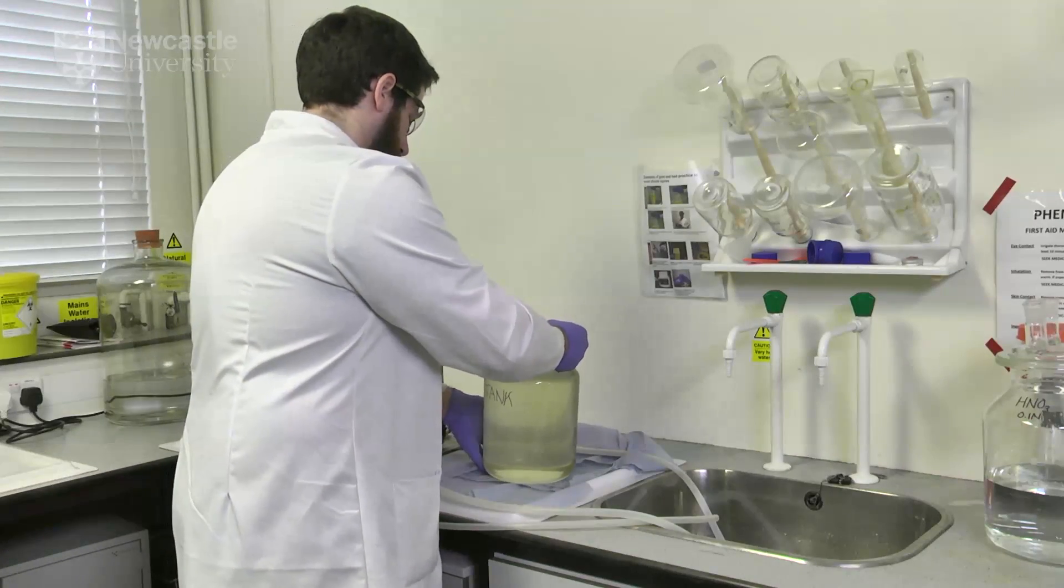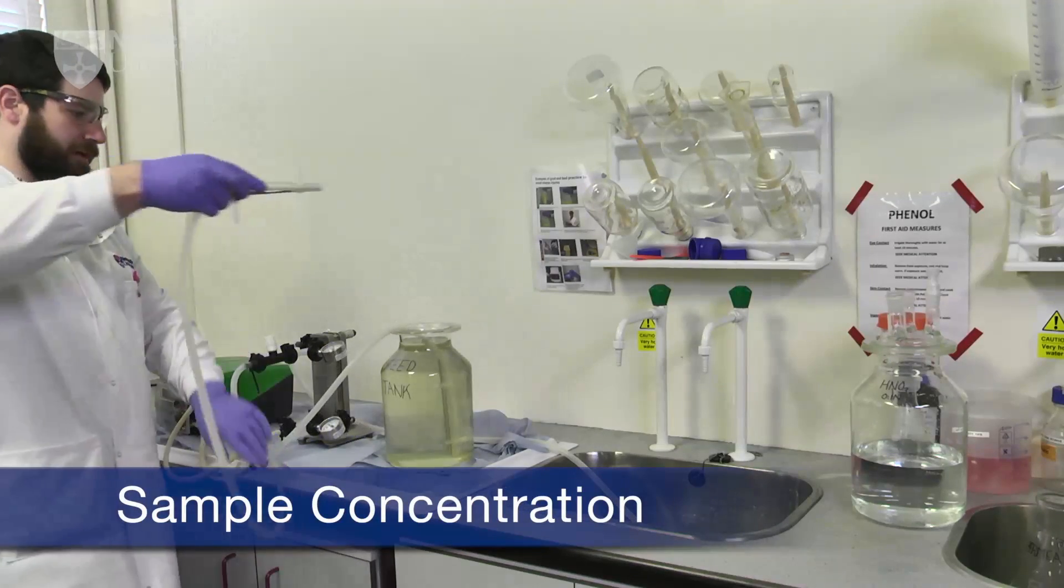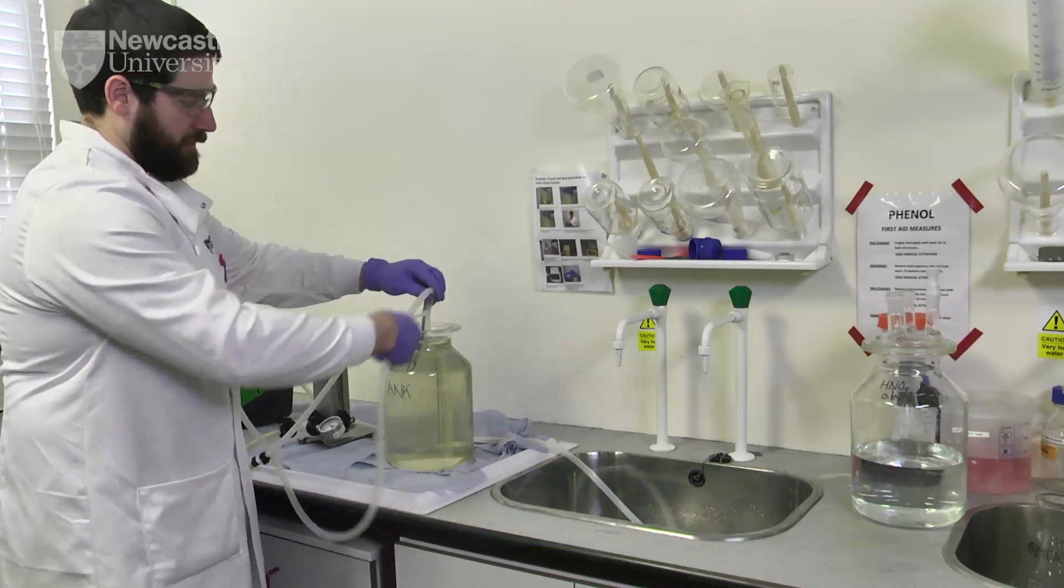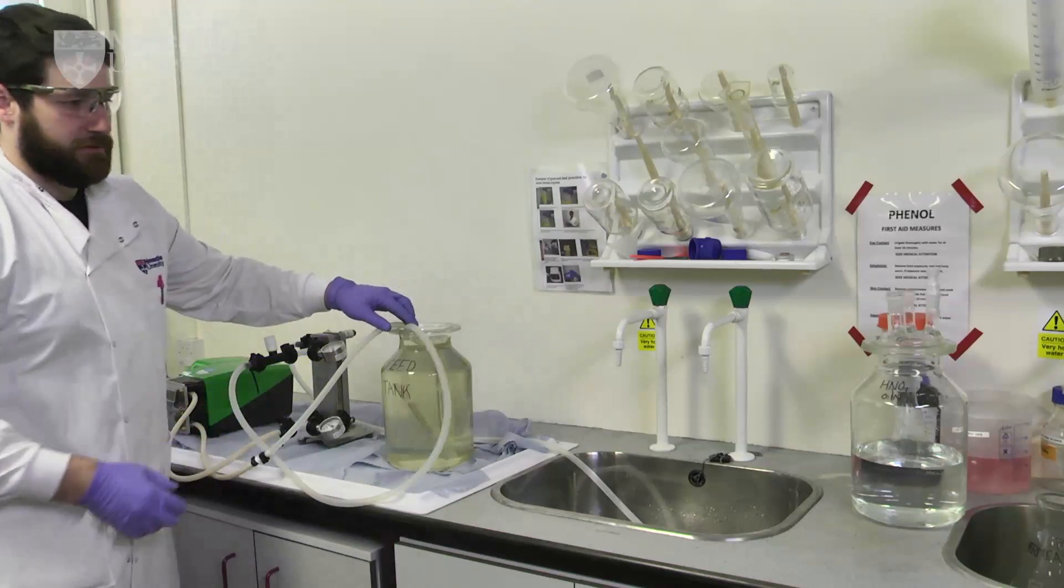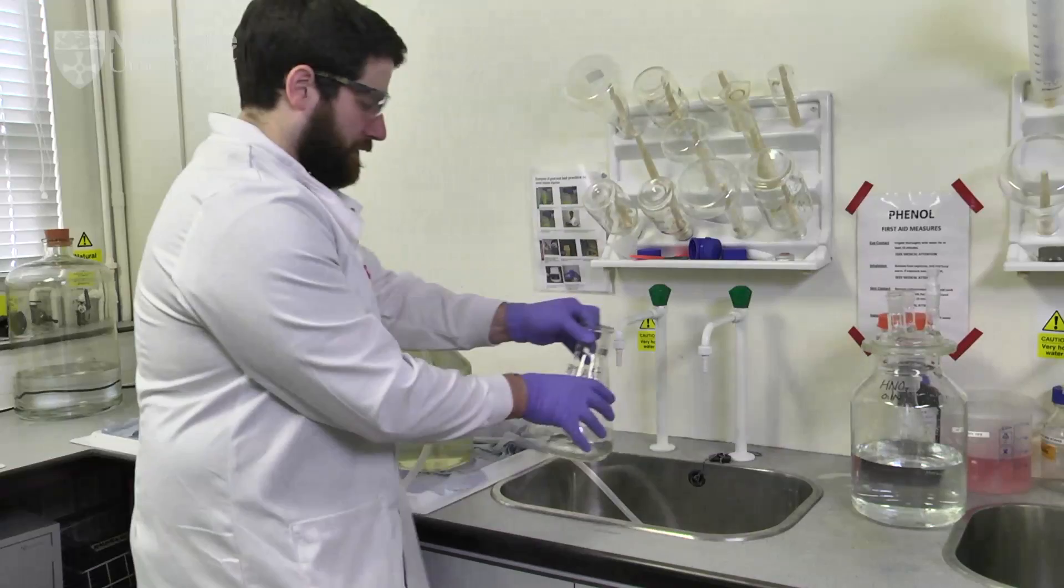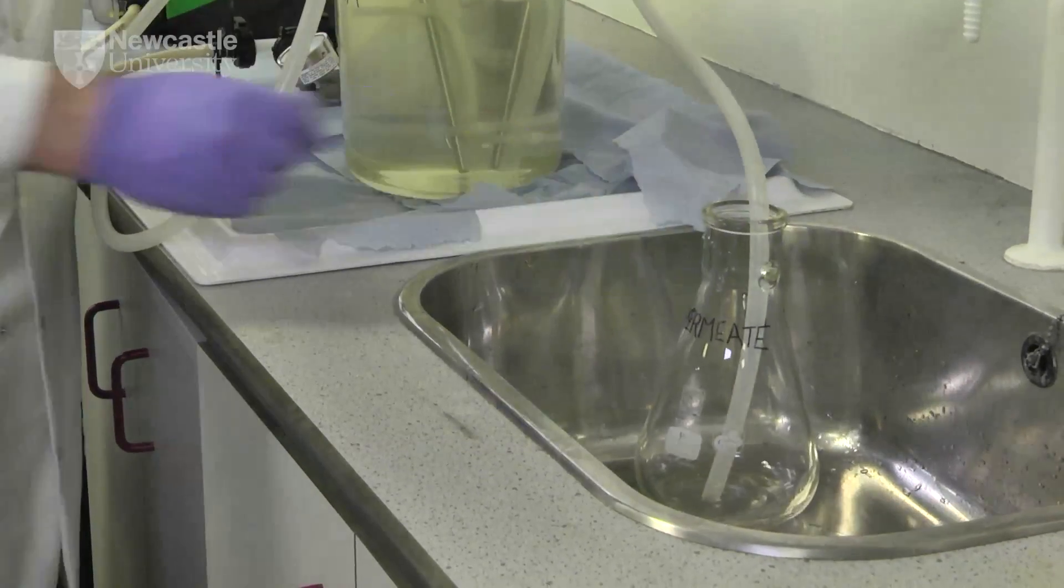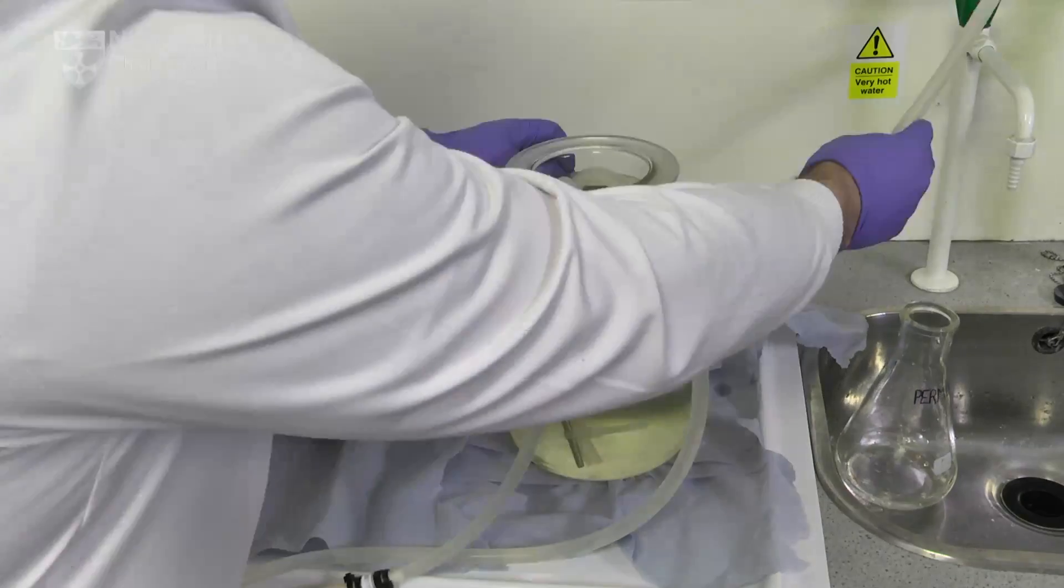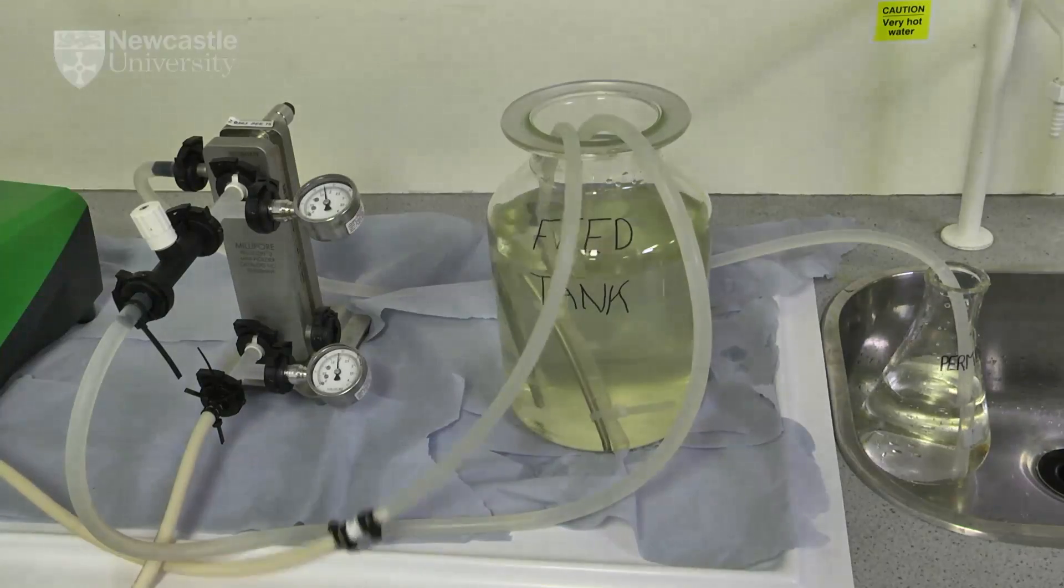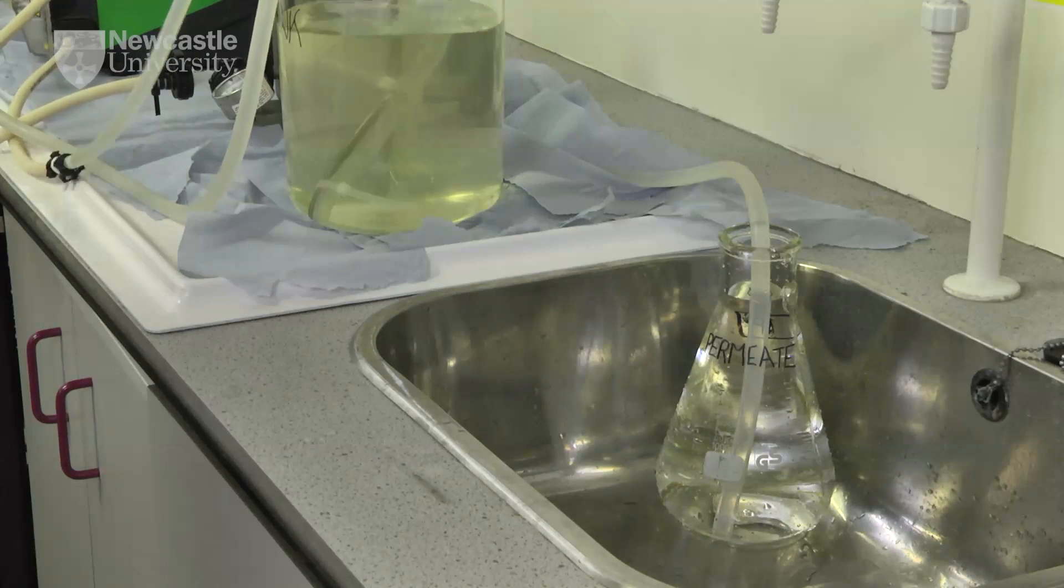To begin the concentration procedure, the feed and retentate lines are placed in the feed tank. The permeate line is placed in a permeate collection vessel which can be allowed to overflow and drain. The feed and retentate pressure can be changed by adjusting the pump speed and retentate valve and monitored on the feed and retentate pressure gauges.